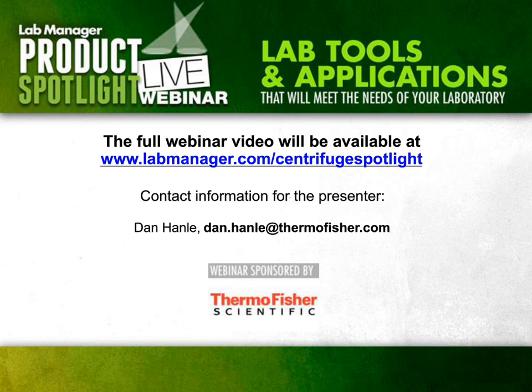Yeah, that's actually become more of a question. Going back, it was pretty obvious that if you really needed the high performance and the large volumes, you automatically went to a floor model. I would say now, somebody who hasn't been in the market for a while, I would just start with that question. Gee, I'm going to be doing this. Can you tell me whether there's a benchtop option? And strangely enough, we also have benchtops where we put a cart under it, or a design of a cart. It's not really a cart. And so it actually turns out to be a floor-standing benchtop, but that just makes life interesting.